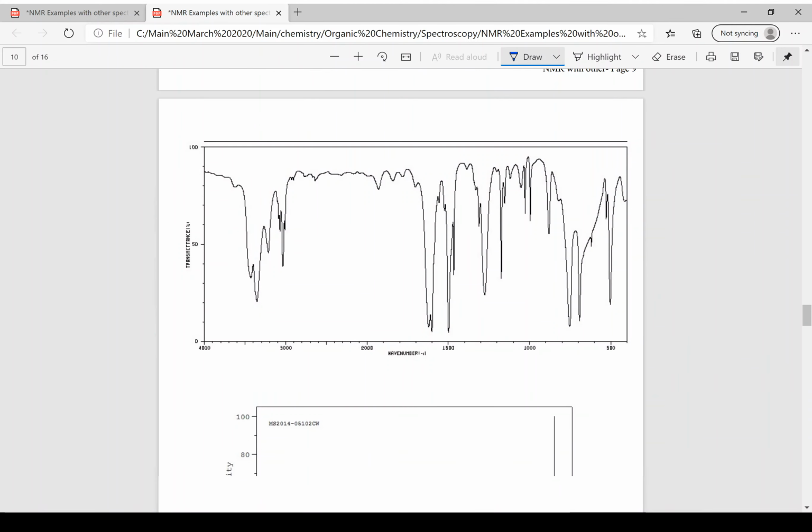Alright, let's look over. Oh, look at that right there. That is an N, and there's 2 peaks, so there's an NH2. There's my sp3s. And I need some here, so those are my sp2s, and there's my combination bands.